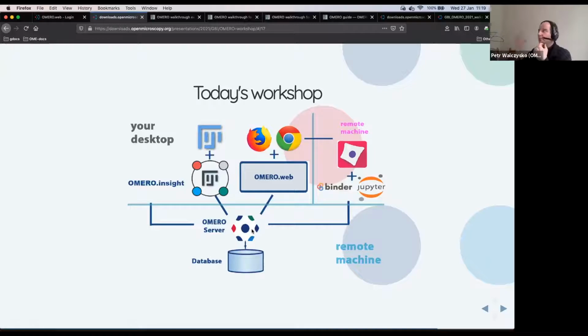This is a lockdown situation in Scotland, and the server is at the University of Dundee compound down the hill. So we are all remote to the server. The remoteness is highlighted again by the light blue line.